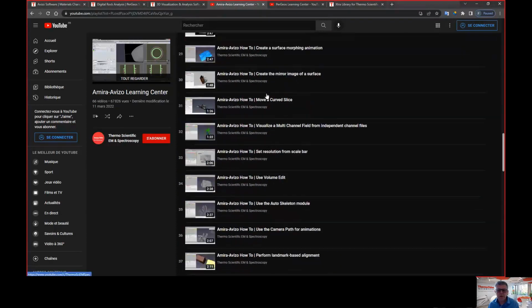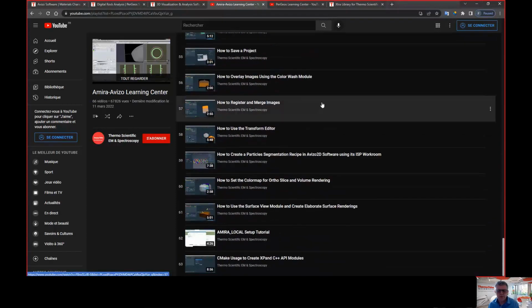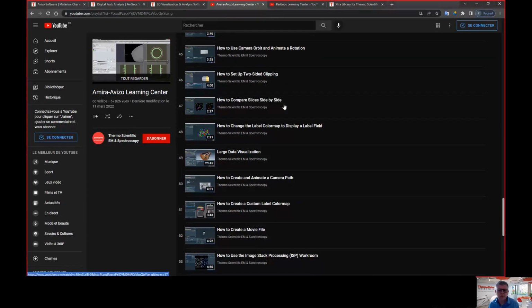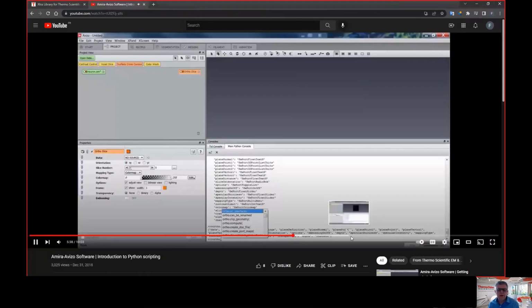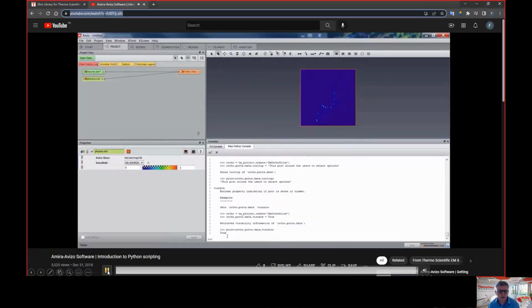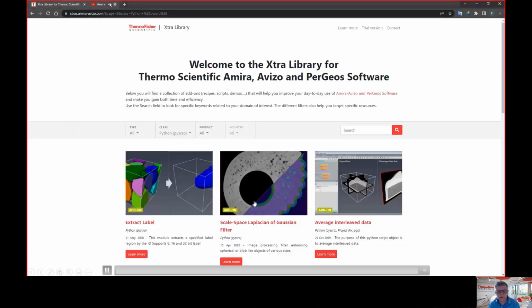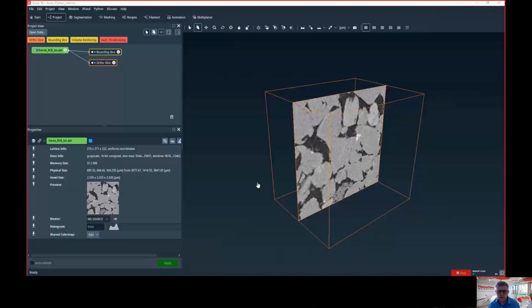So there are plenty of them, but there is one specific to Python. You have to Google it, you will find it. This one is pretty nice. It does roughly what I did, with a little bit of difference, so it's complementary to what I did.